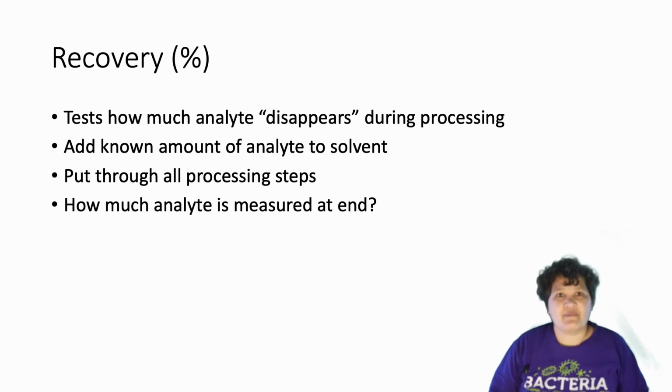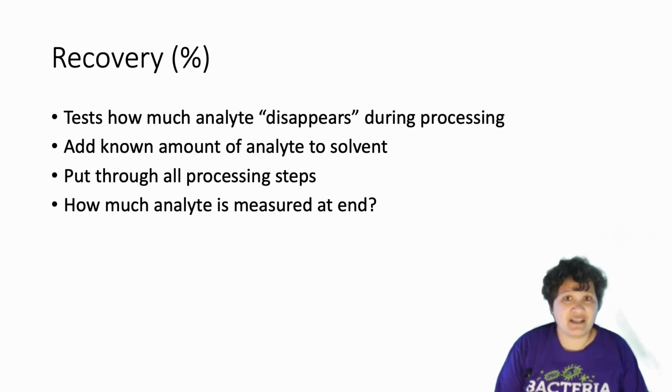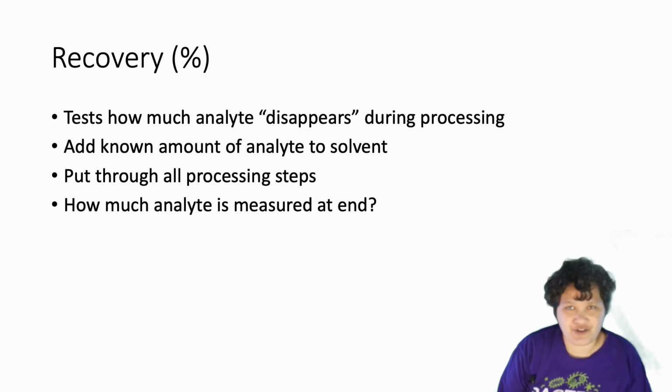Now, just because you get a bad recovery percentage doesn't mean your method is horribly flawed. For example, we've personally found that for some analytes, you have to be very careful which filters you use.